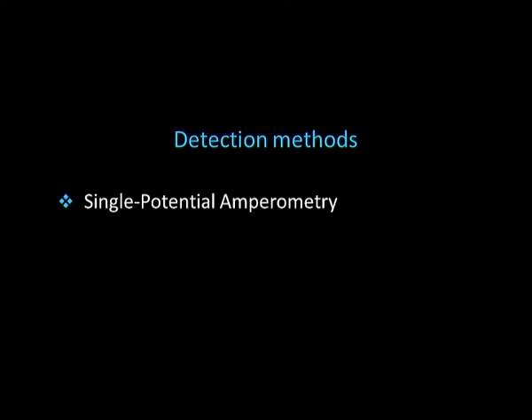The detection methods are single potential amperometry and pulsed amperometry. Let us discuss them one by one. The first one is single potential amperometry.